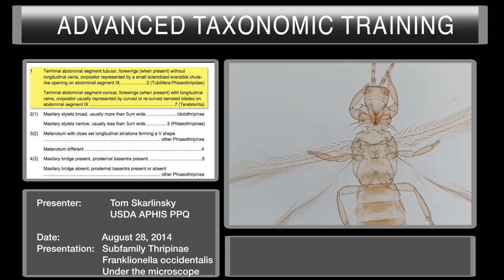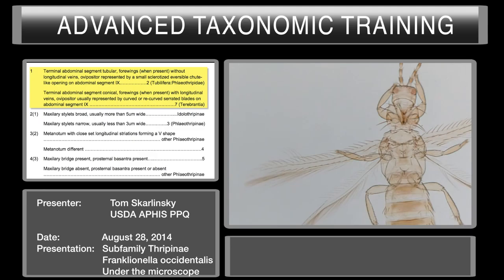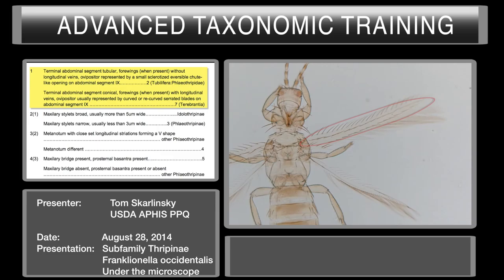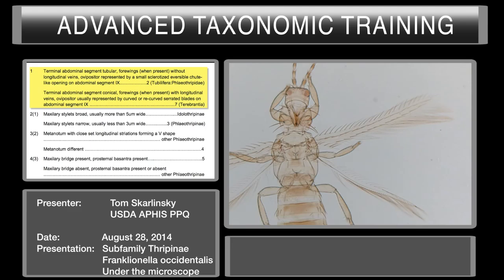Let's go ahead and check out the terminal abdominal segment. We want to see, is it conical? Or is it tube-like, like a PVC pipe? Looks more conical to me. So let's go ahead and pretty much establish that the tenth abdominal segment is conical. So we're at Terebrantia.